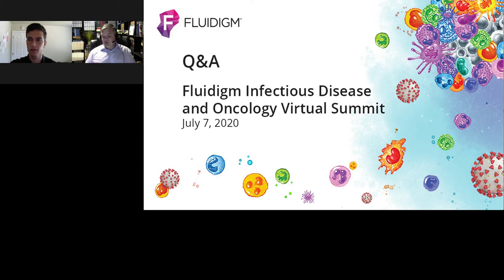We won't adjust those gates to, say, the 90th percentile of data or something like that. So you do have to go through and review gates, and make sure that the gates are in the correct positions. But when you get them in the correct positions, we can save that in FCS Express, and you can use that from sample to sample.